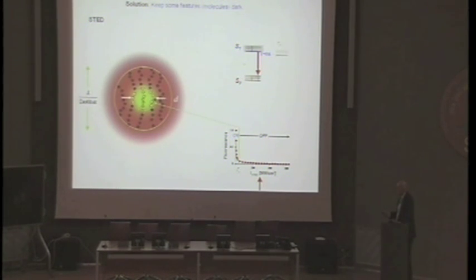Of course, we can adjust the resolution by adjusting the intensity. Now fewer molecules are turned off. The resolution is only of that size. And now the resolution is poorer. It has advantages if the resolution is poorer as well, because then you don't have to make many fine steps. You can be quicker in your image if you want to image fast and you don't need high spatial resolution. It's better not to turn off so many molecules and go quick over the sample. So you can adjust your resolution and the speed of imaging at the same time. And they are, to some extent, mutually exclusive. That's inherent in the concept.